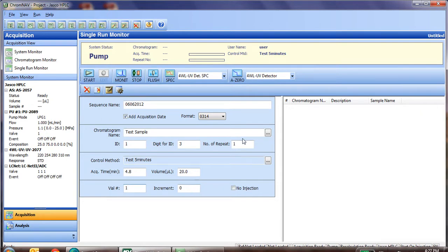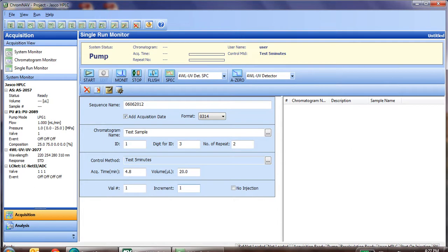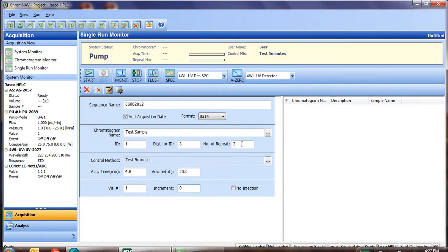If we are to do repeats, for instance, two, this would repeat vial number one twice. Otherwise, if we change this increment to one, it will first do vial number one, and then it will increment by one, meaning the second injection will do vial number two. But again, we're just doing a single injection, so we'll leave the repeats at one and increment by zero.